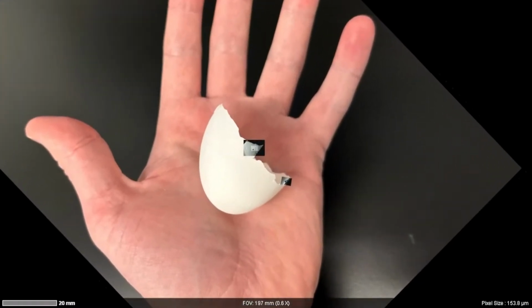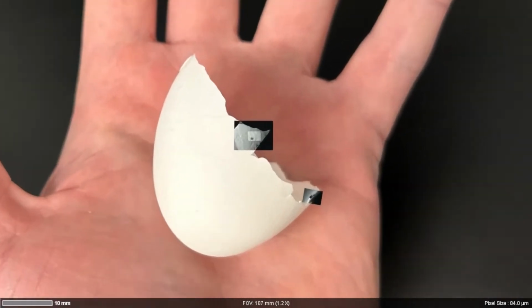I'll narrate over it. So here we are. I'll pause right now before it dives in. The lowest magnification picture, if you want to call it that, didn't come from a microscope. It's actually a photo from my cell phone that I imported into the software. And now we'll be diving in, going first to an image from an optical microscope, our Axio Zoom, and then higher in magnification to look at very tiny structures on the egg. So I'm going to go ahead and press play now.